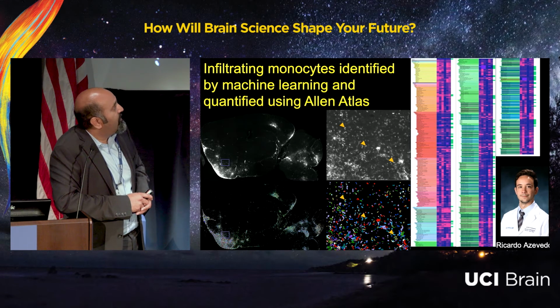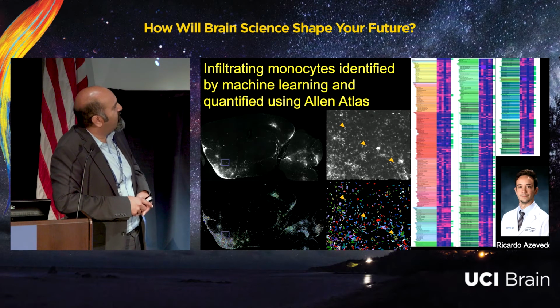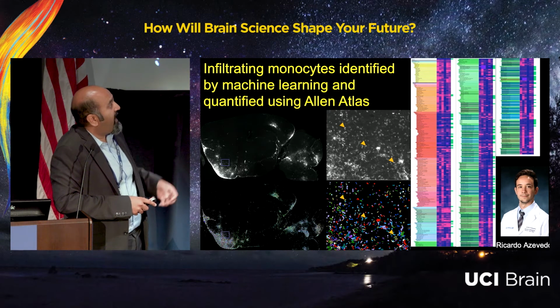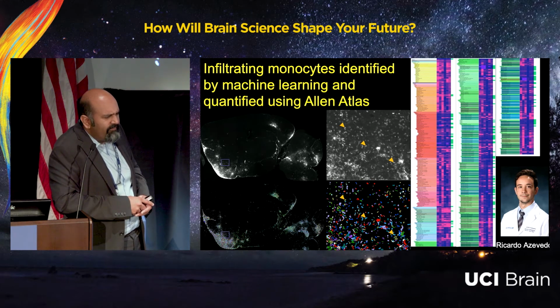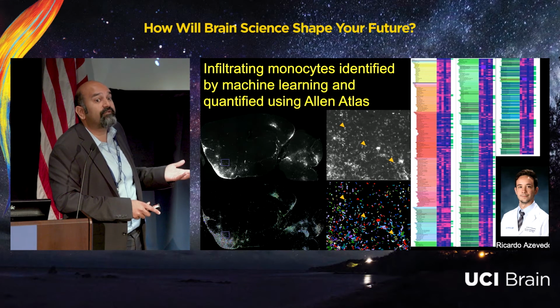Each row here shows you a different brain area. Sorry, you can't read it, but that's because there are a lot of brain areas. There are brain areas in here I'd never heard of before, actually. It's kind of cool to go through this list. And this data shows us that there is a sporadic, irregular pattern of expression. But maybe for some of you in the audience, it reminds you of something. Maybe it reminds you of sequencing data.